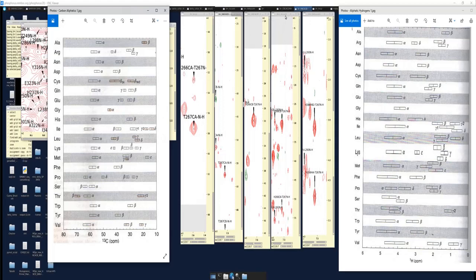The HCCONH can give us some clues. If it was a glutamine or glutamic acid or arginine, we would expect a peak somewhere in the 30s, like 35, or a peak a little further back for arginine, such as around 26, right, as can be seen here. But we don't have that. So that does narrow our search down a little bit.